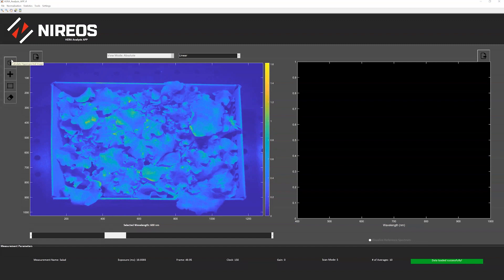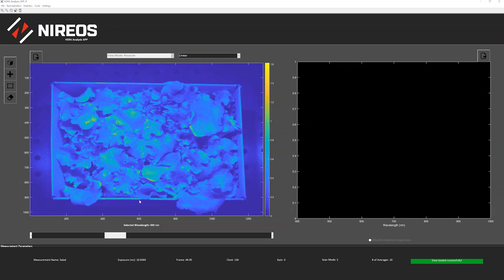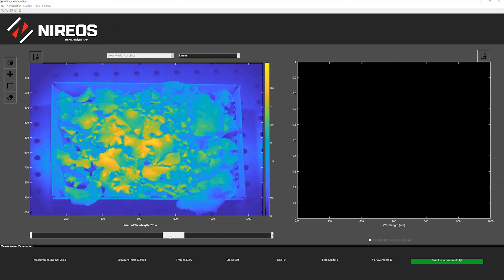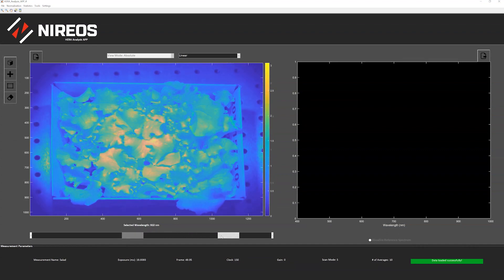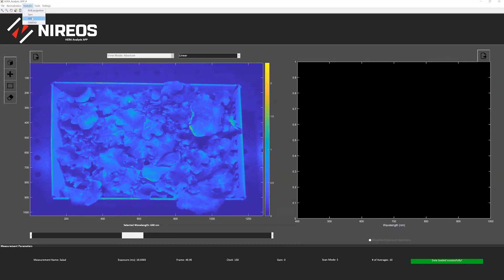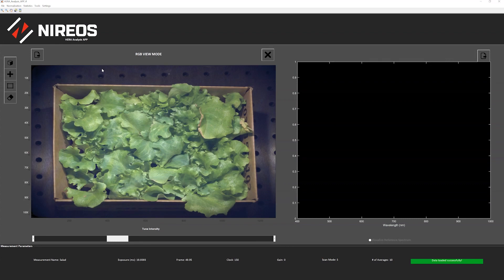After a few seconds, the hyperspectral image has been computed. Now we can see the image at 600 nanometers, and here you can select the wavelength where to show the image between 400 nanometers and one micron. We can then go to the statistics toolbar here and select RGB projection.